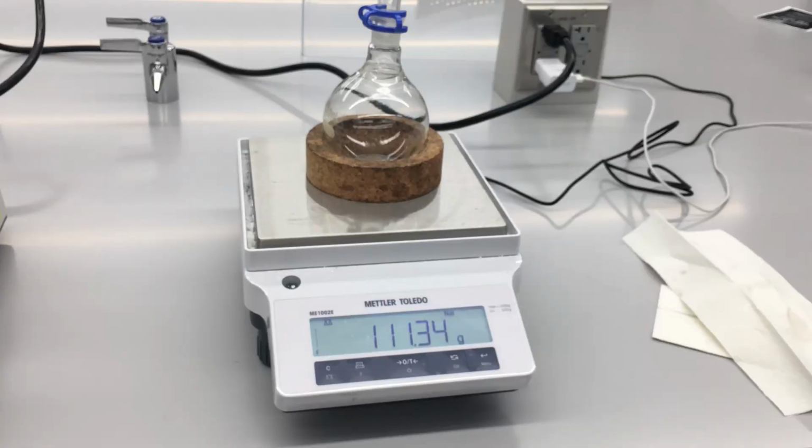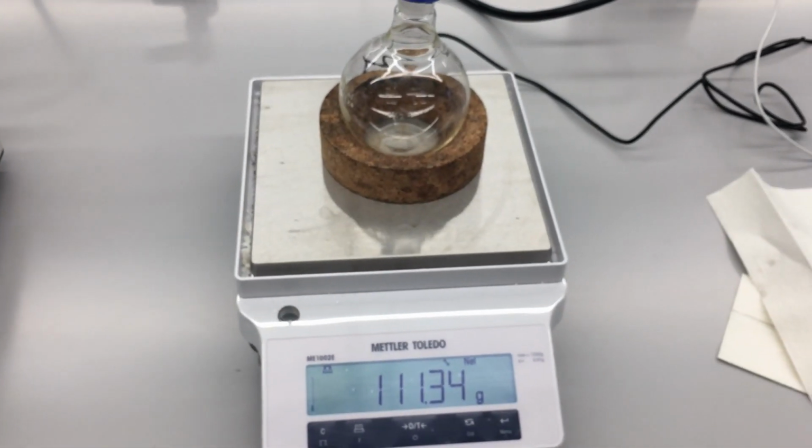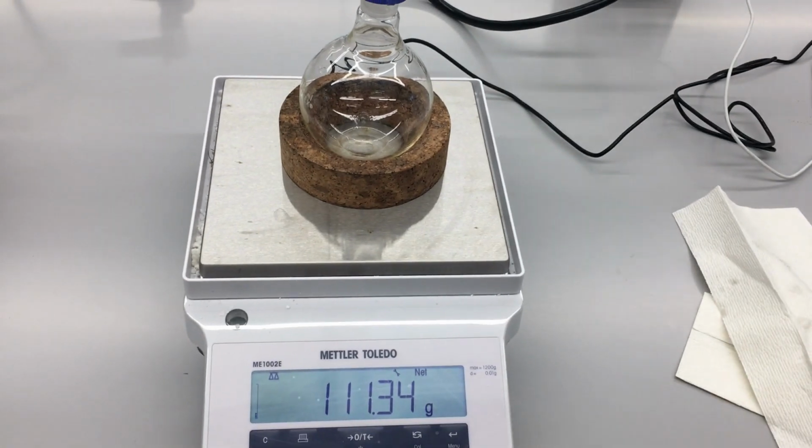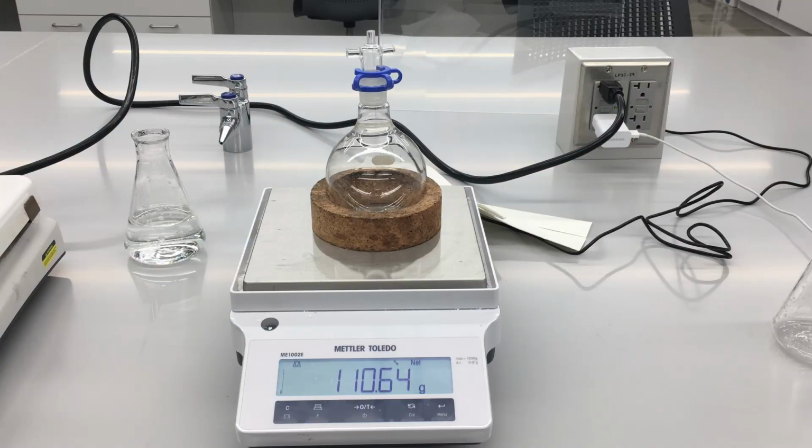Which will be our volatile compound plus a round bottom flask from just the round bottom flask. So that way we can get the mass of the volatile compound on its own. You see here we have about 111.34 grams. Subtract that from our previous one, we should be able to get just our volatile compound.